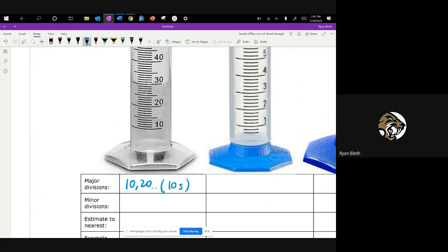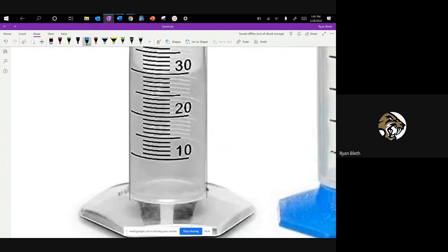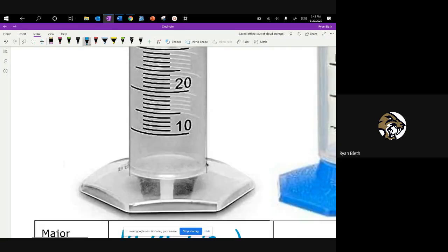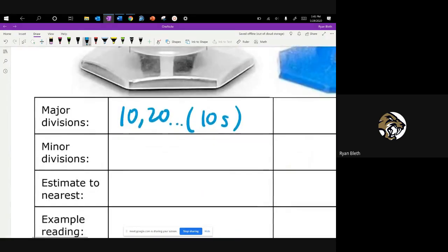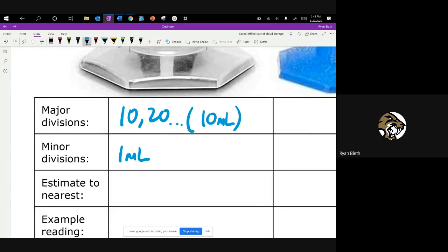The minor divisions on this device — if you look closely, they're marked in between the 10 and the 20. There are enough marks that each of those represents one milliliter of the fluid. So the minor divisions are to the nearest one milliliter, and the major divisions are to the nearest 10 milliliters.